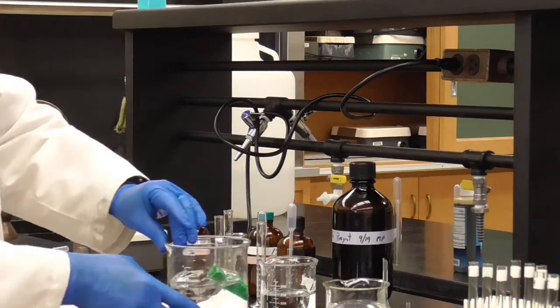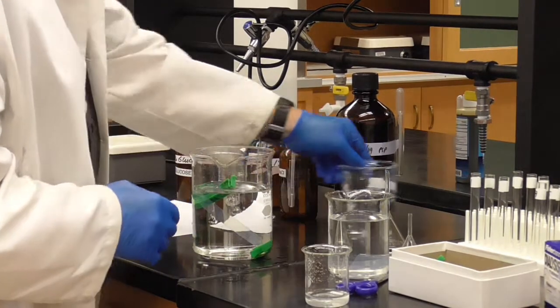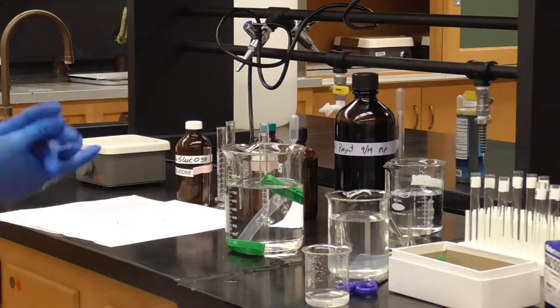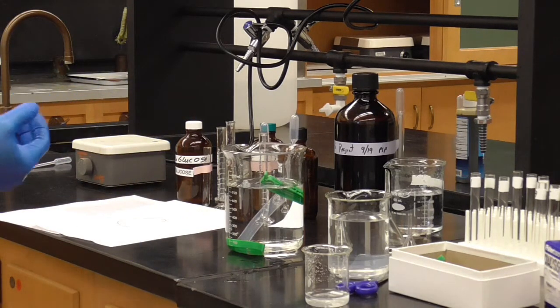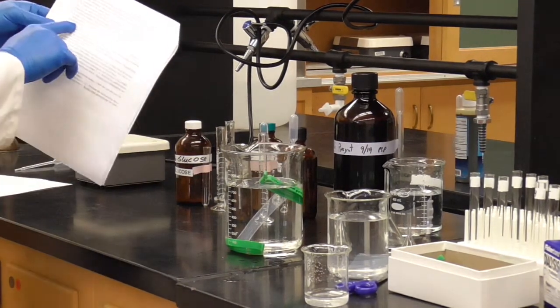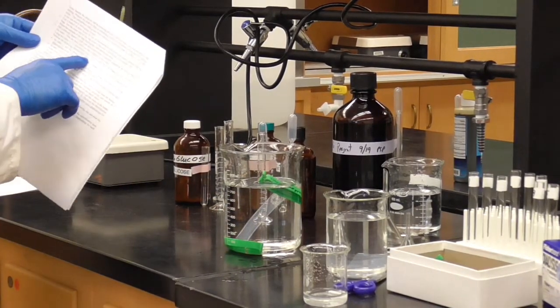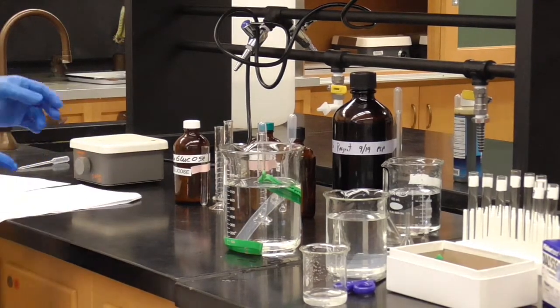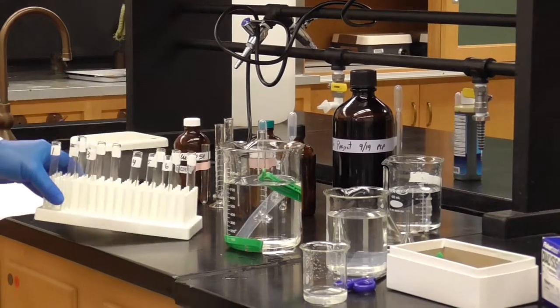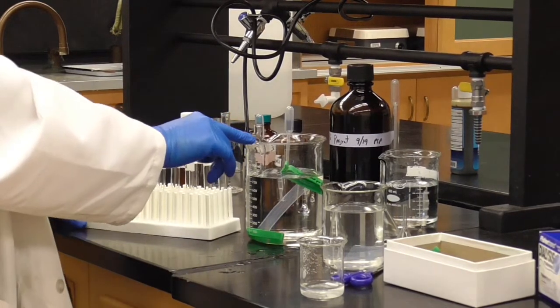I want to make sure the whole dialysis tubing is submerged down below the level of the water. Okay, so there we go. We've got it dialyzing now, so the net is in the big ocean, if you will, and little things might start to go across. Now, right away, it says to immediately take out from the water out here into test tubes, 3 milliliters into 3 different test tubes. Why? Because we're going to test that outside water for those 3 things to see if they're getting across the net. And so we're going to do that right away. We're going to take about 3 milliliters out of each one.